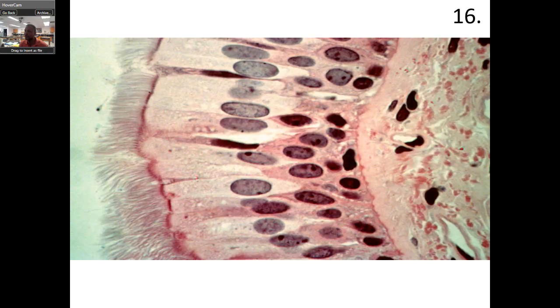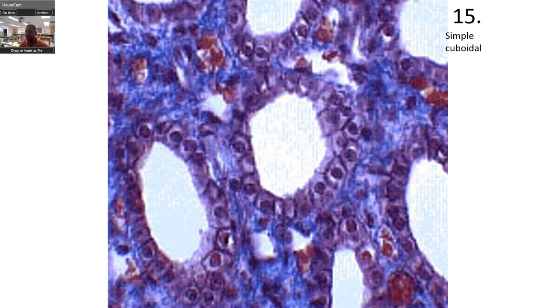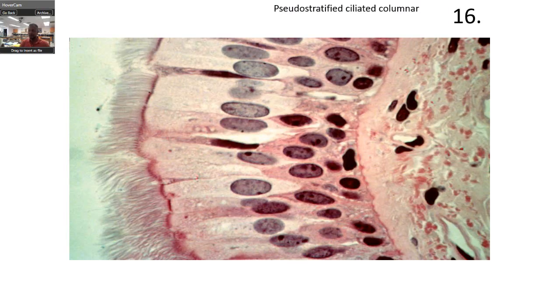What is this? Notice the cilia. Notice this is one layer — it looks like several layers, but it's one layer. So that would make this pseudostratified ciliated columnar epithelium, PCCE.